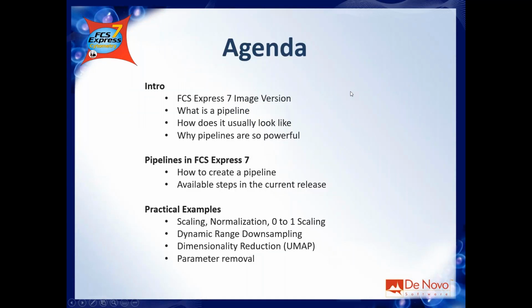So this is the agenda for today. I want to spend a few words on the image version for those of you who never tried FCS Express for image. We will see what a pipeline is and how it usually looks, and also how it looks in FCS Express, which is really much better. And also why pipelines are so powerful and why we decided to implement pipelines in our software.